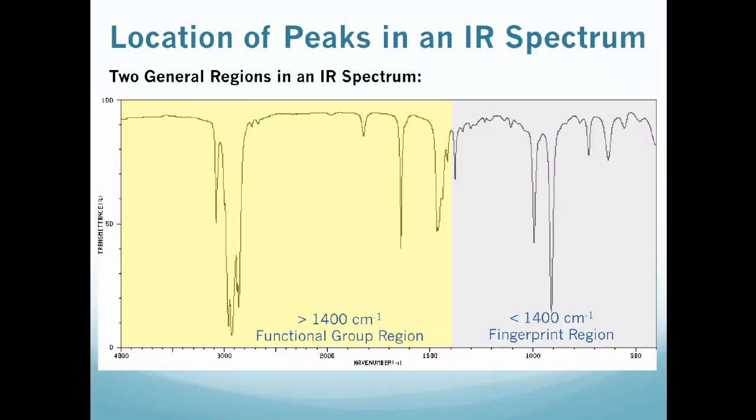This next section really gets us into the heart of IR spectroscopy, and we're going to be looking at different spectra and comparing them with molecules, and we're going to see what these peaks mean and how they can help us determine things about molecular structure.